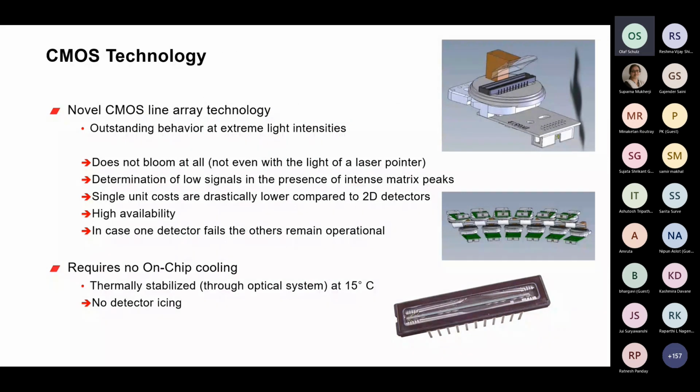So one challenge of the ORCA design is that the spectrum is focused on a curve, and thus the installation of flat surface detectors is really not directly possible. And with a perpendicular installation on the focal curve, only a single point would be focused. A solution to this problem offers the mounting of the units above and below the focal curve and the use of aspherical mirrors, curved aspherical mirrors, to image the spectrum onto the photosensitive array.